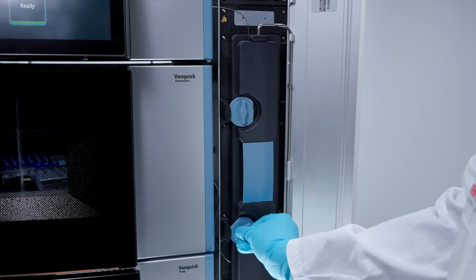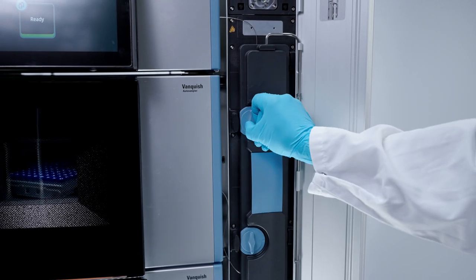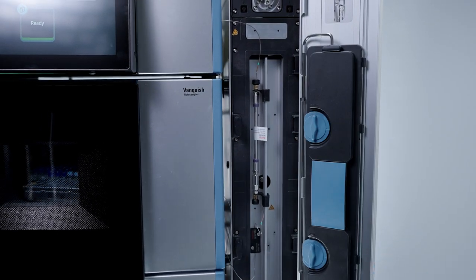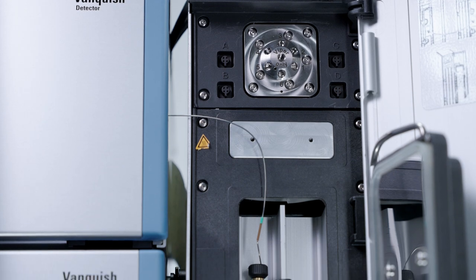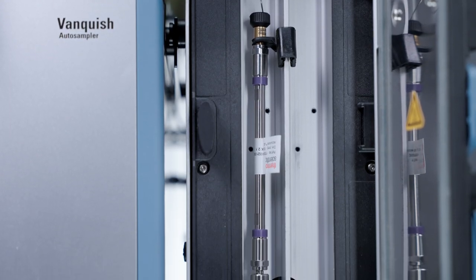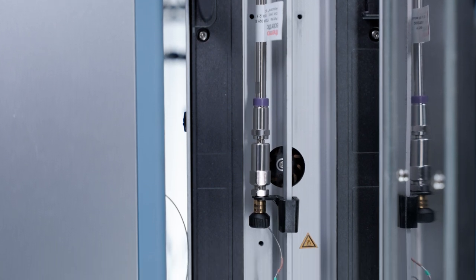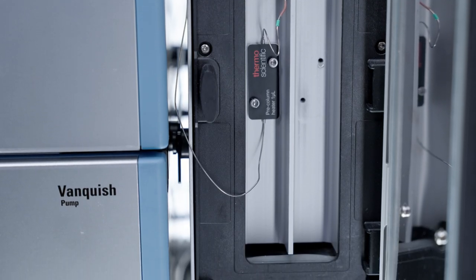Active and passive eluent preheating options and two-column thermostatic modes ensure superior UHPLC performance by matching column and eluent temperatures. Two additional column compartment valve positions extend the system's workflow versatility.